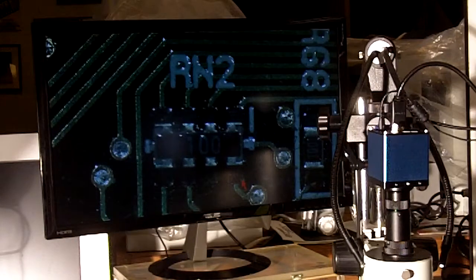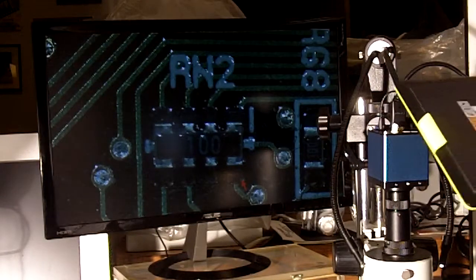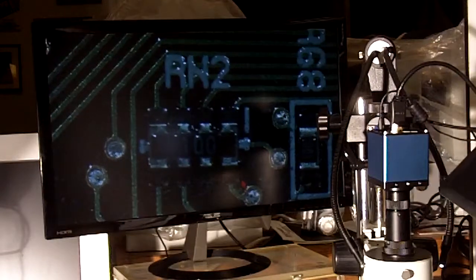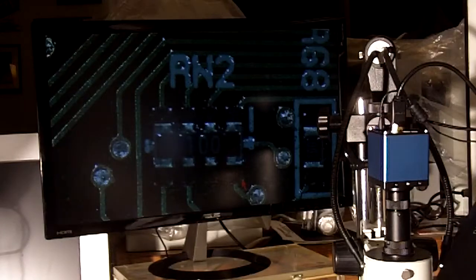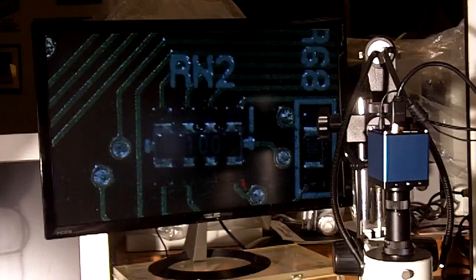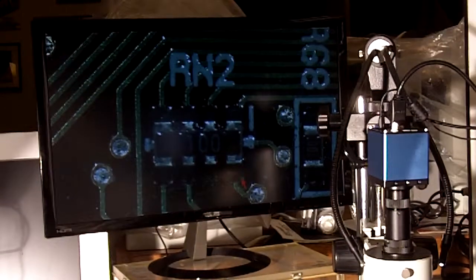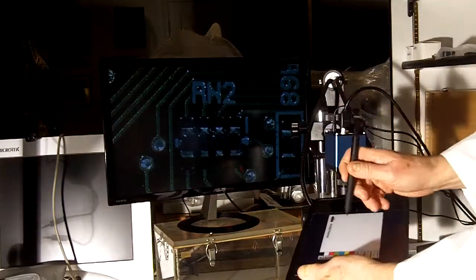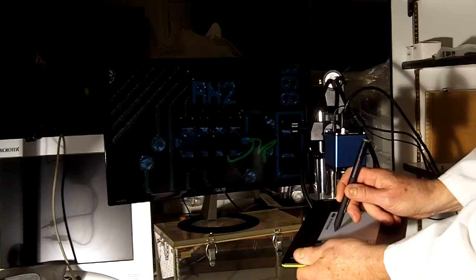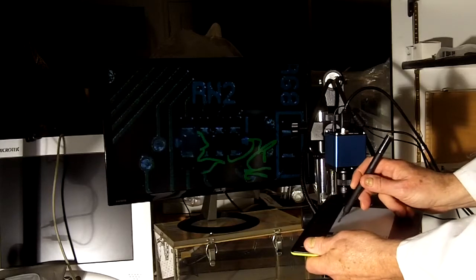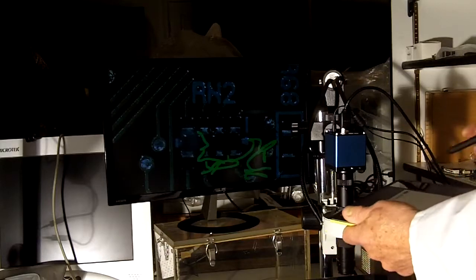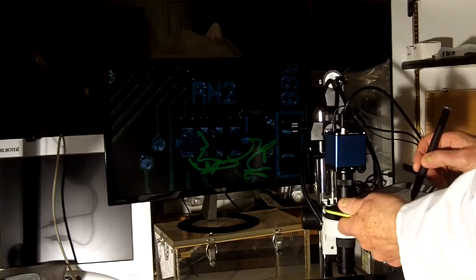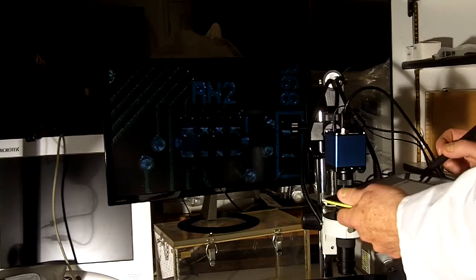We can also bring into the equation as an option to the keyboard and the two button mouse a digitizing tablet that is connected to the black box. Now what we use is a stylus and we can go in and do basically the same thing. This would be for someone who just wants to make on-screen annotations without the typewriter feature. Probably a little more user friendly. And we can quickly clear all annotations.